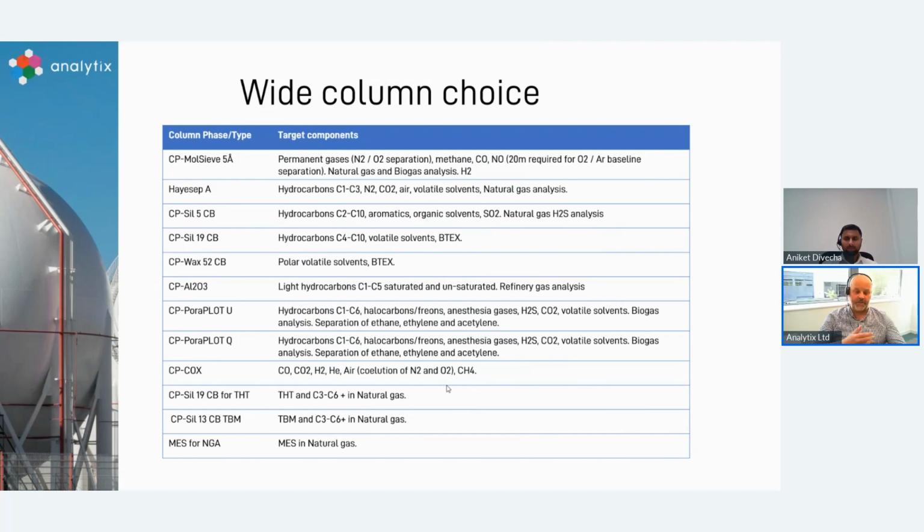And then there's a variety of pre-columns that we can fit, say 1, 3, 5 meter onto there, again based on certain things that we're trying to get rid of, normally related to CO2. So if there's a large amount of CO2, we want a longer pre-column within there. But we've got options within all of these columns and channels to change the length of those analytical parts.